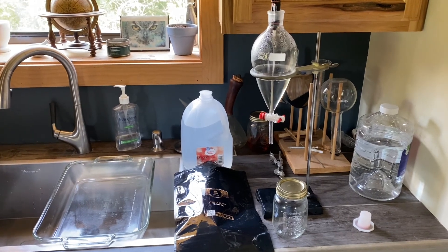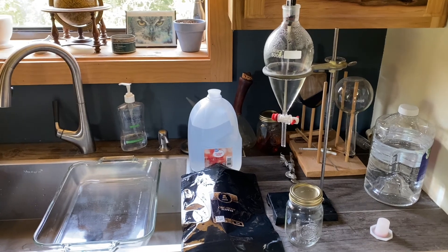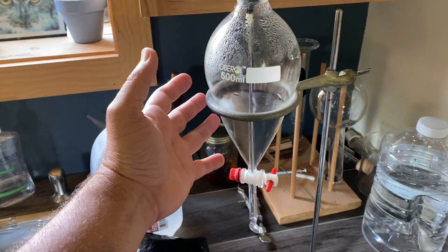Hello. In today's video, I'm going to show you how to do a simple CBG extraction. You'll need a separatory funnel — that's the main mechanical item that you'll need.